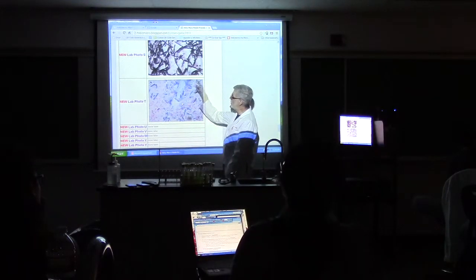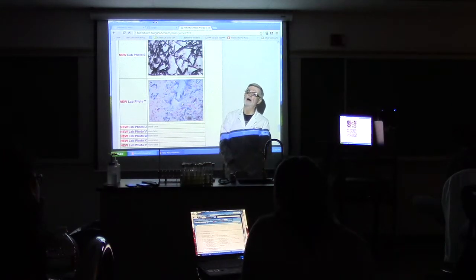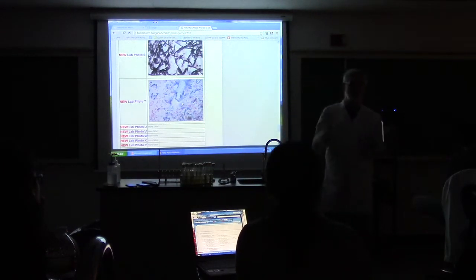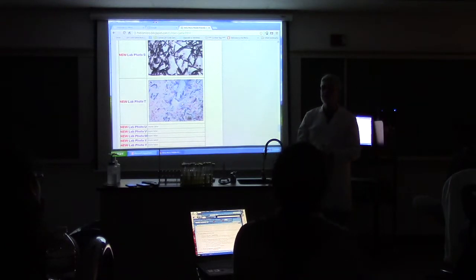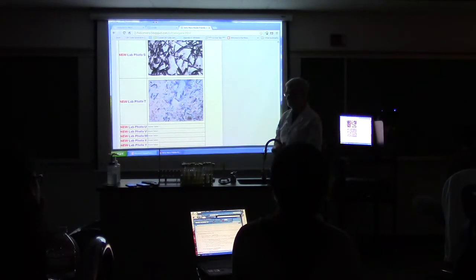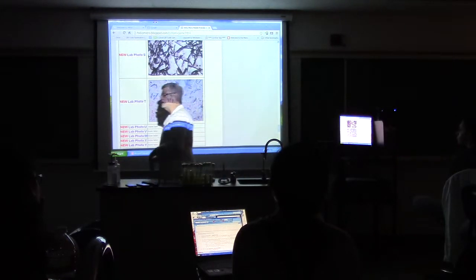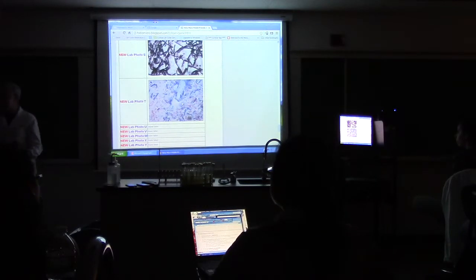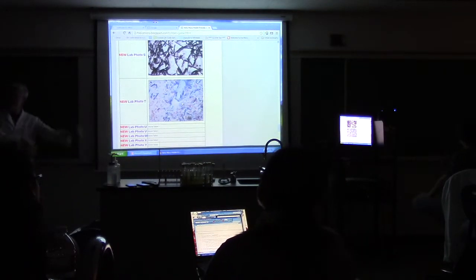Baby blue rods makes it what? Negative. All right, so one last thing on acid-fast, and that's the correct nomenclature, but I want you to forget it. Remember how I said if it keeps the first color you put on, it's positive, and if it keeps the second color you put on, it's negative. And for the gram stain, the majority rules, but for the acid-fast stain, one hot pink rod makes it positive.